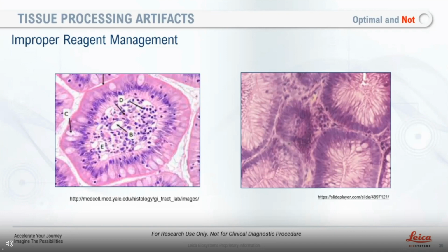All right, thank you. Next question. How long can processed tissue sit out before it's embedded?